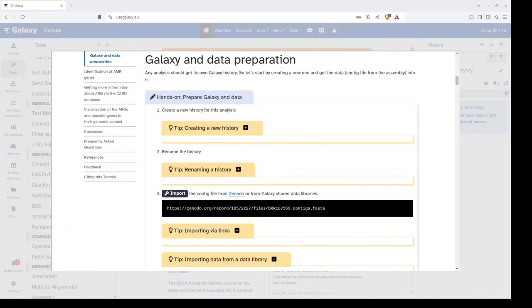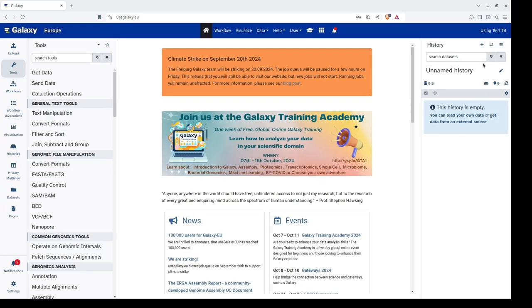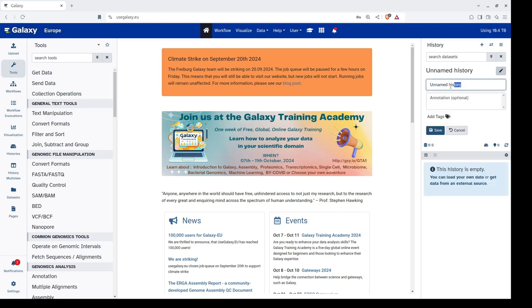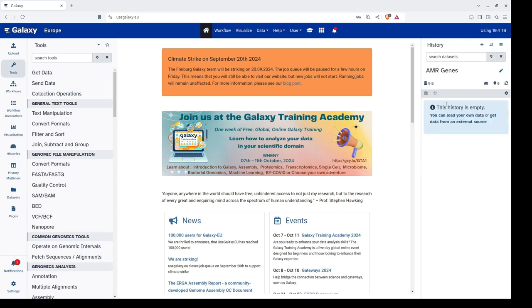To get started with this analysis, the first step is to create a new history, rename it, and import the required files. To create a new history, click on the plus icon, and then click on the pencil icon to rename it. Now we have successfully created a new history and renamed it.